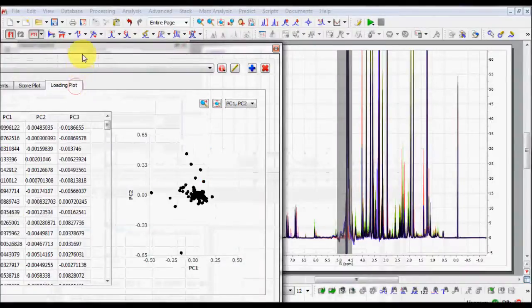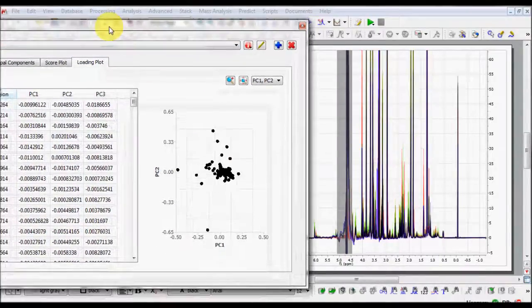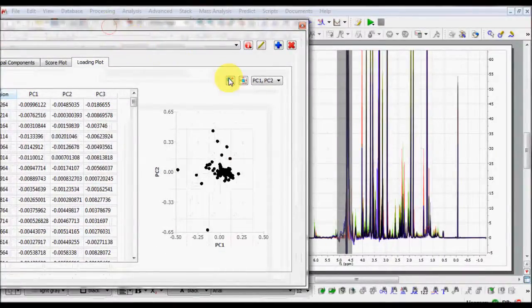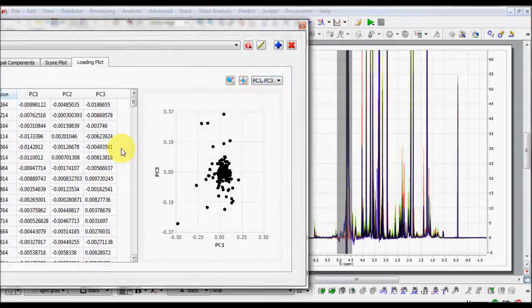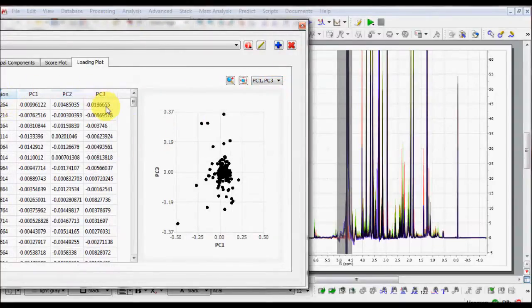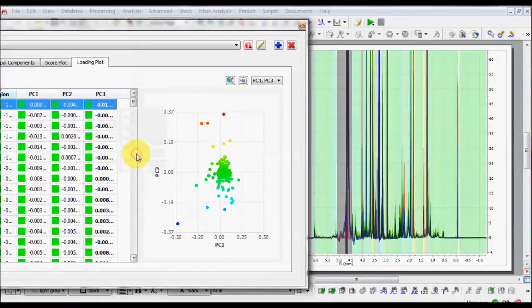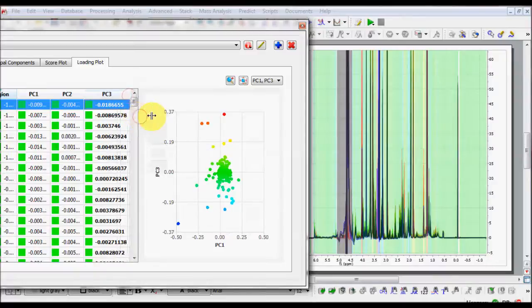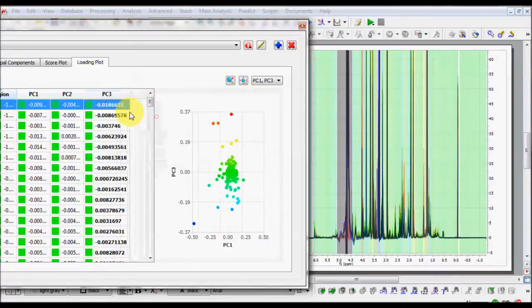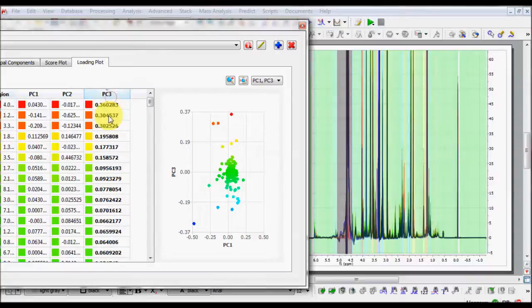Now have a look at the Loading tab. You can select which component pair you wish to work with. And again, you can color code the loadings according to their absolute values. You can reorder the loadings by clicking on the head of each column. Automatically, the color is propagated between the Loading Plot and the Stacked Plot.